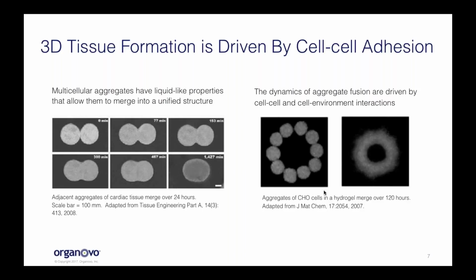That is, how one prepares the cells, how one prepares the bioink, and then how, after you've fabricated a tissue, you might mature it into your ultimate goal, which would be a native tissue-like structure that one could interrogate.